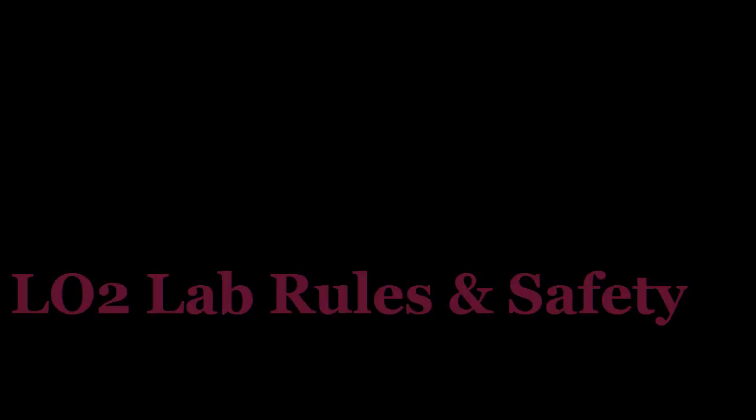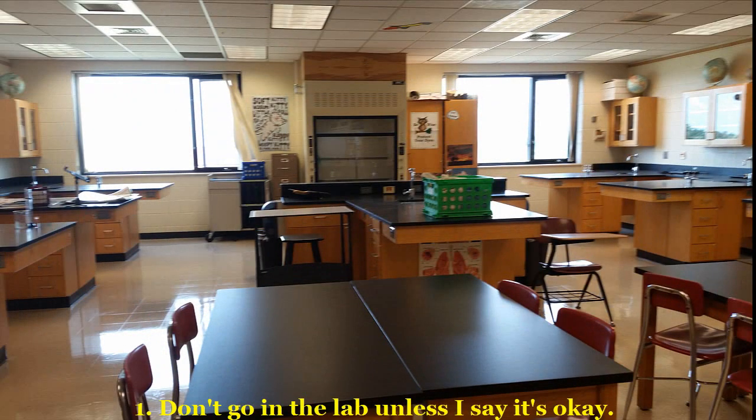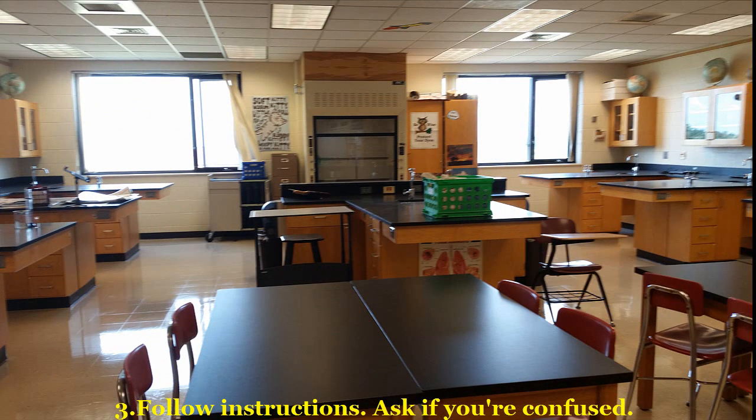They're pretty self-explanatory, but they're still worth saying and hearing. Number 1, stay out of the lab area unless I give you permission to go back there. Number 2, when you're back there, be responsible. Don't joke around, don't pull pranks. We could be working with dangerous things, and I don't want any accidents. Number 3, follow all instructions carefully. Ask me if you don't get something.